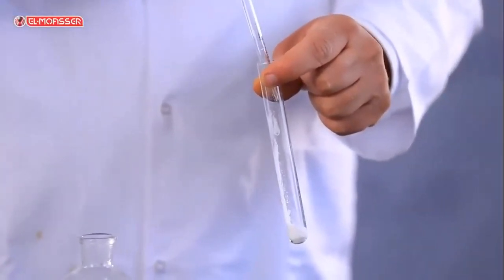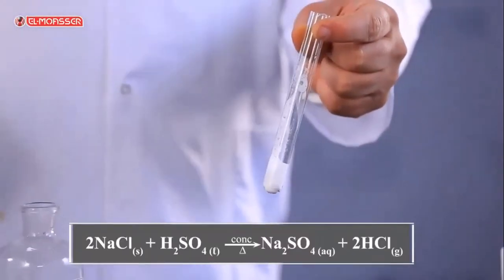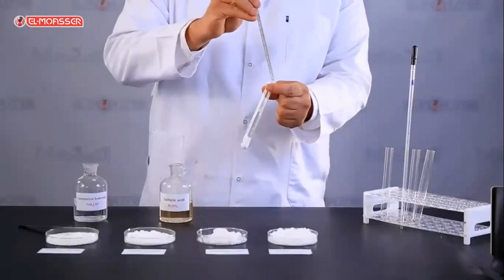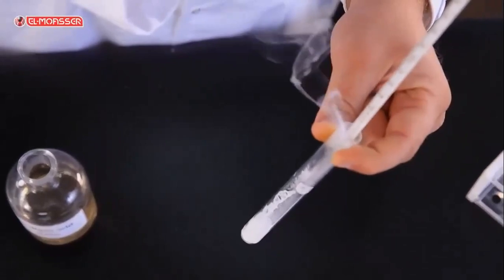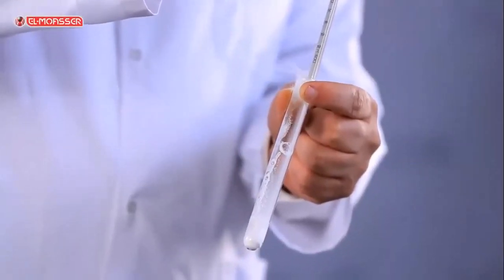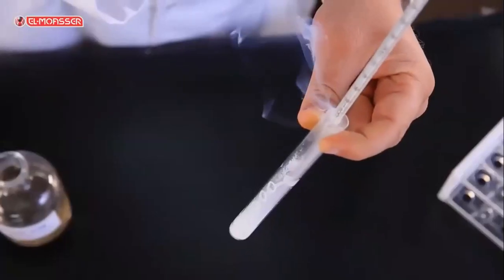What do you observe? Effervescence is observed because hydrogen chloride gas evolves, which is colorless. On approaching a glass rod wetted with ammonium hydroxide or ammonia solution to the mouth opening of the test tube, it gives white fumes of ammonium chloride.